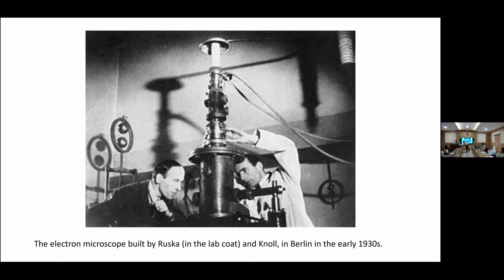Okay, so if you compare the electron microscope with the light microscope, the parts used are the same. We have a source, condenser lens, then sample region, then eyepiece or objective lens, and everything is the same. But in the light microscope we are using visible light, and here we are using an electron beam. So just imagine what possible changes we need to make for an electron microscope compared to an optical microscope. The only change is that we are using an electron beam instead of light.